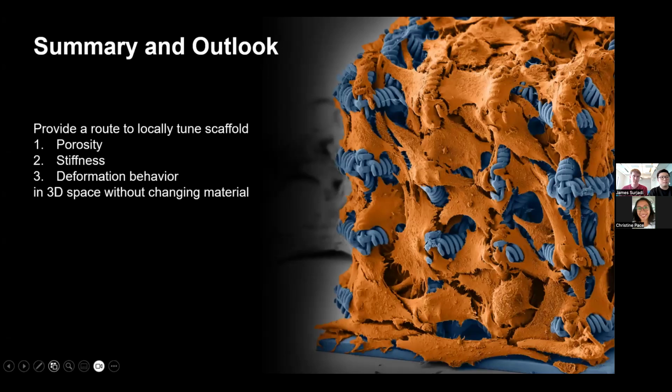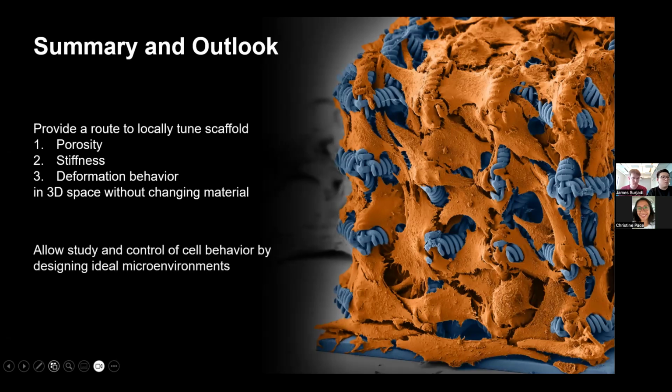So to summarize, we demonstrated a framework to locally tune porosity, stiffness, and the deformation behavior of 3D bioscaffolds in three-dimensional space without needing to change the material composition. This not only allows us to study, but also control cell behavior by designing the ideal microenvironment for each cell type.